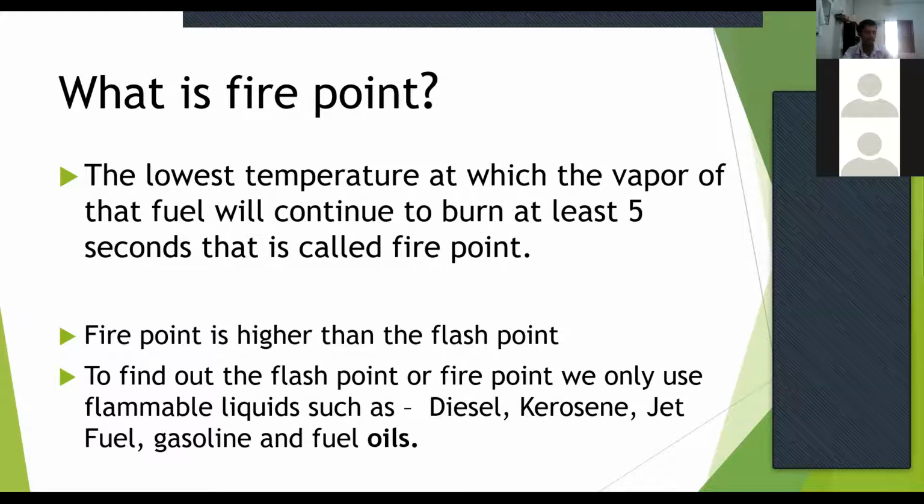I think you had studied this in the lecture also. I think you are clear now about the flash point, right? If we don't know what flash point is, then there's no point of doing this practical, because you couldn't understand how we will find it out. We are going to find out the flash point, right? Therefore, I am telling what is flash point and what is fire point, and what the difference between them is. And this practical is only about flash point, right?